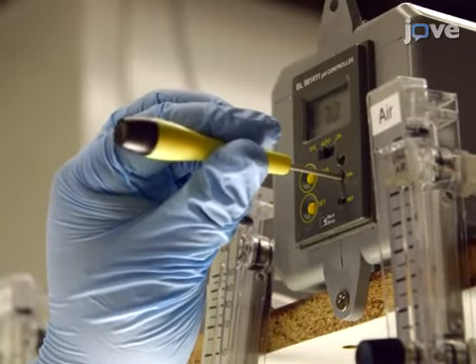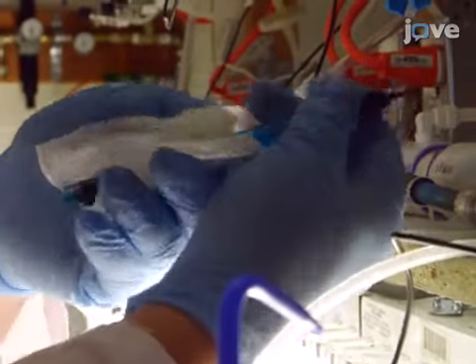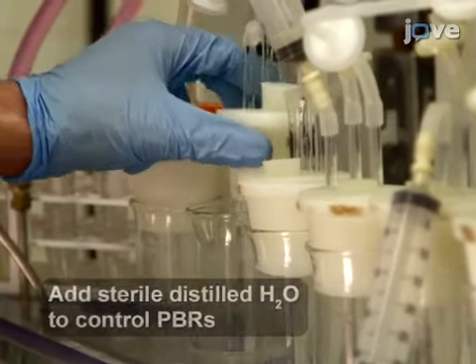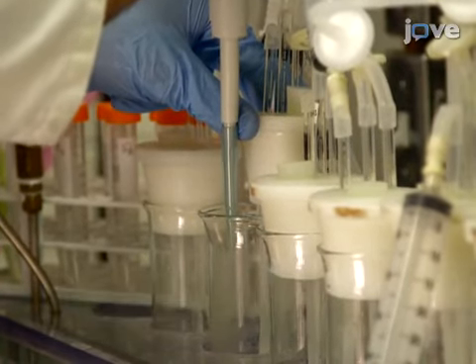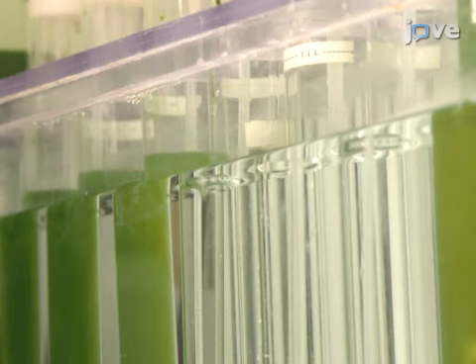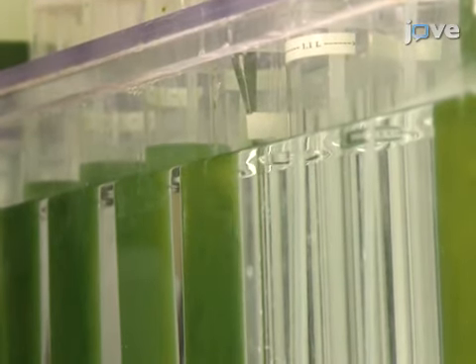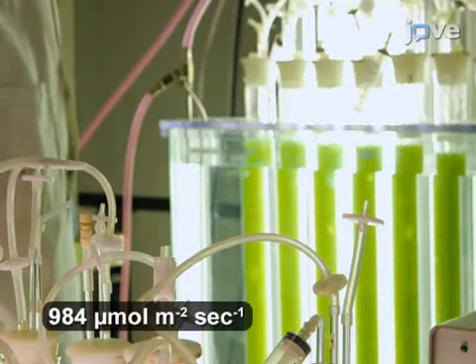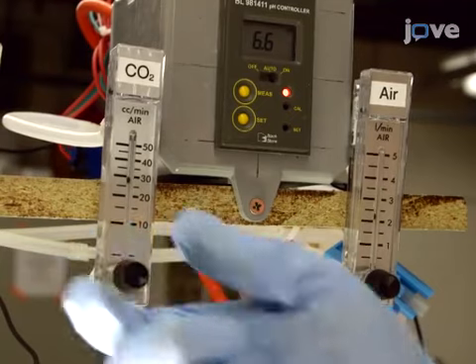Calibrate the pH meter and pH controller. Using 70% ethanol, sterilize the calibrated pH meter. To each previously prepared PBR, add 1 milliliter of each of the sterile inorganic contaminant stocks to reach a final concentration shown in this table. Next, add the concentrated microalgae inoculum to the experimental PBRs at an initial culture density of 1 gram per liter. Then, turn on the high-intensity lights and pH controllers and adjust carbon dioxide to 30 cubic centimeters per minute.